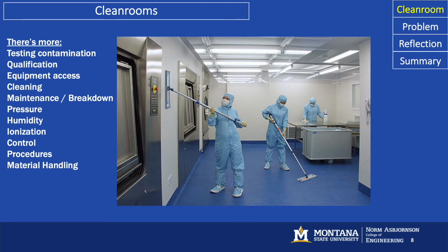And in fact, one of the biggest aspects of production that we haven't even talked about is material handling. If you're working in the clean room, how do you get the parts? How do you get them out while still maintaining their cleanliness?